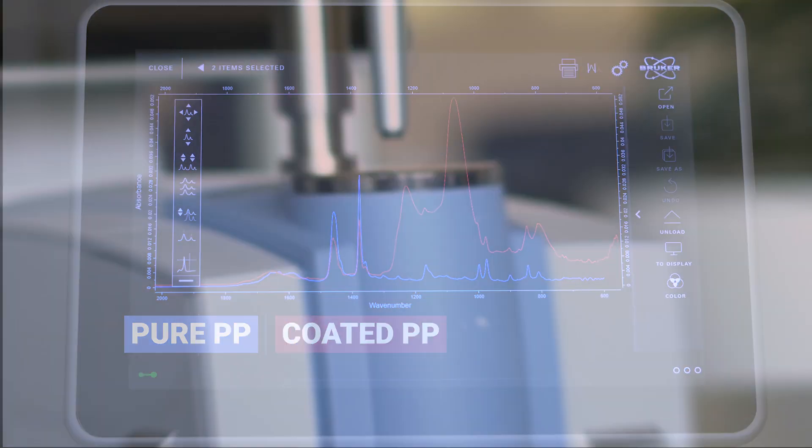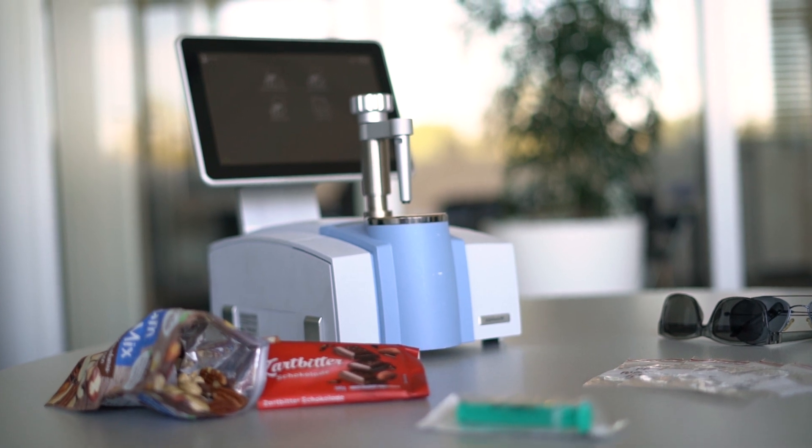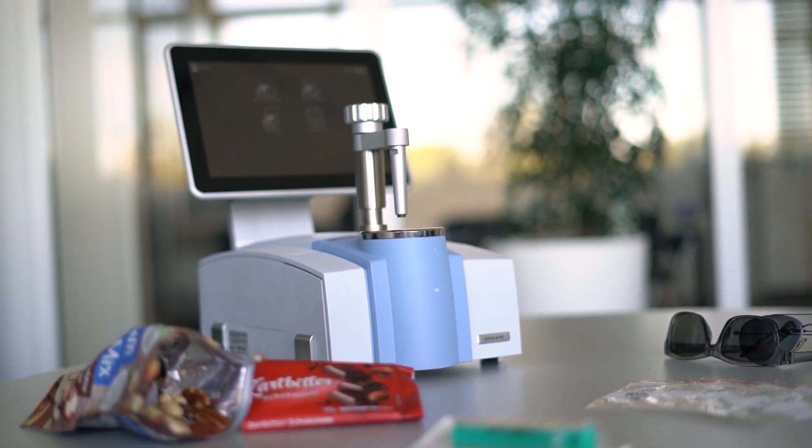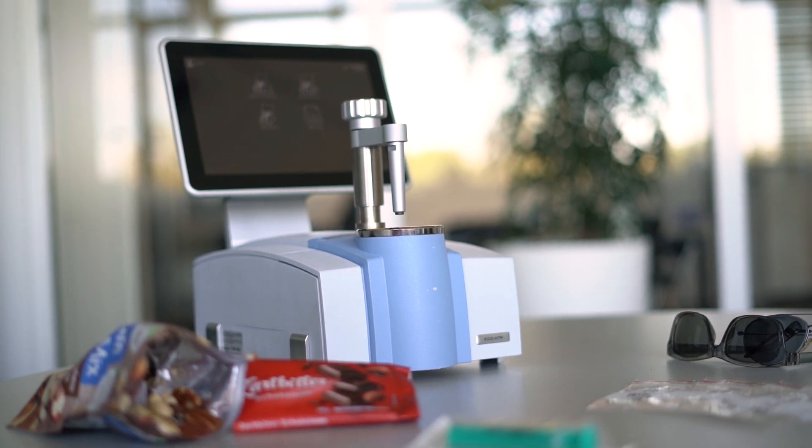For efficient product development and quality control, the Alpha-FTIR rapidly yields conclusive and easy-to-understand data on virtually any of your polymer or plastic samples.